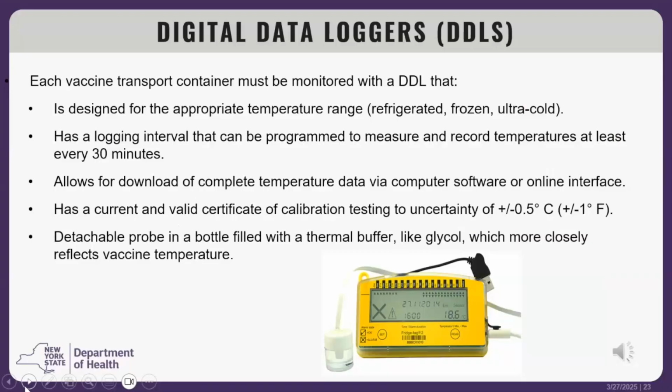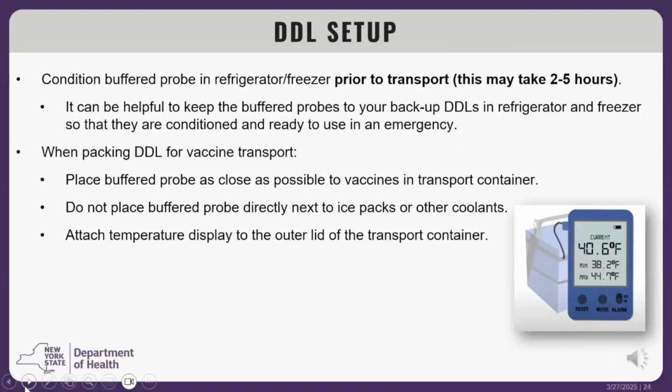Condition the buffered probe in the storage units prior to transport. This may take a few hours. It's a good idea to keep the buffered probes for your backup DDLs in the refrigerator and freezer so that they are conditioned and ready to use in the event of an emergency.